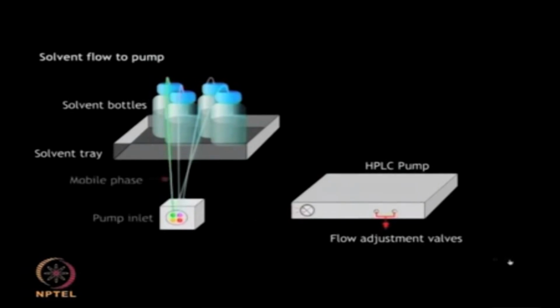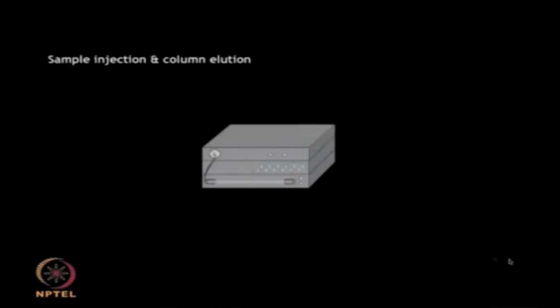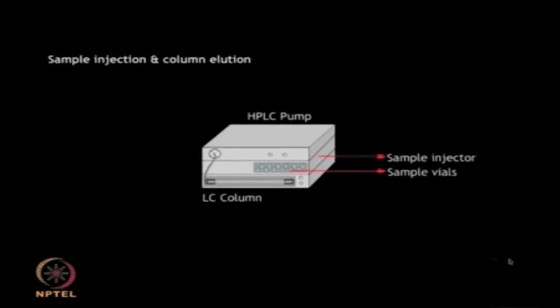Different solvents can be placed in the solvent bottles depending upon the purification requirements. These solvents are mixed in the desired ratio and pumped into the column during elution after removal of any trapped air by means of the degasifier.